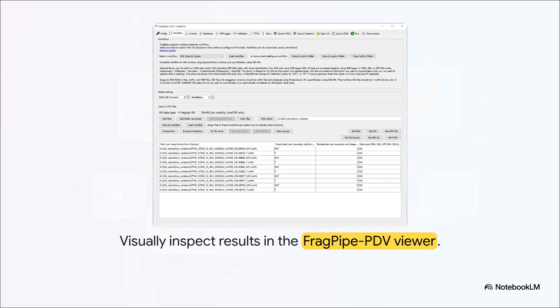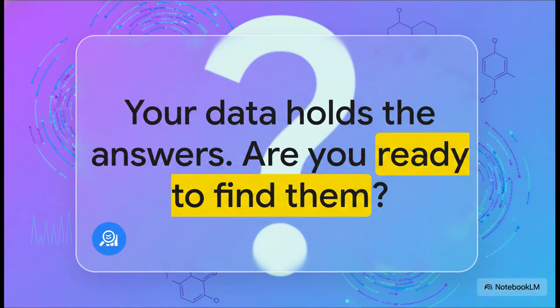At the end of the day, all those answers you're looking for are locked away inside your complex data. A tool like FragPipe is just there to give you a powerful and really friendly way to find them. So the only question left is, are you ready?